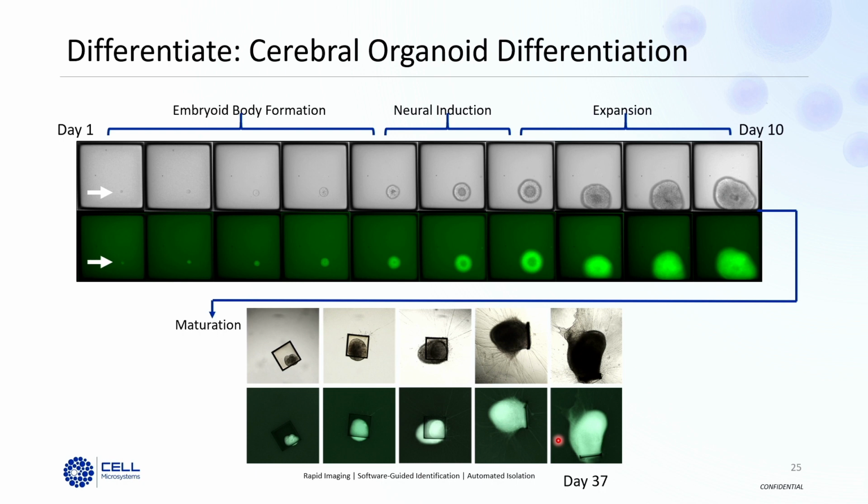You can also isolate multiple 96 well plates from an array. Whilst we know we can't directly deposit into a 384 well plate, you will have hundreds or indeed thousands of clones in a single array. So the strategy there would be, we can isolate as many 96 well plates as we have clones on the array. It's two paths to the same end, but no, not directly into 384.